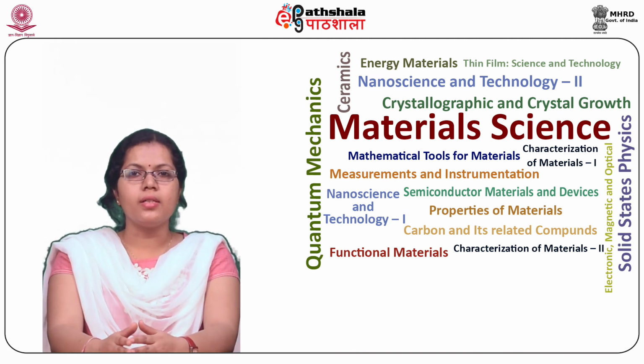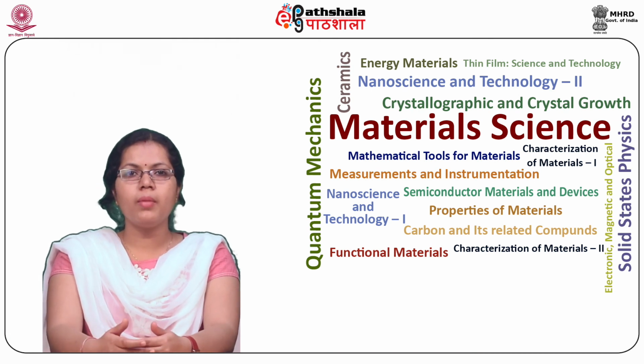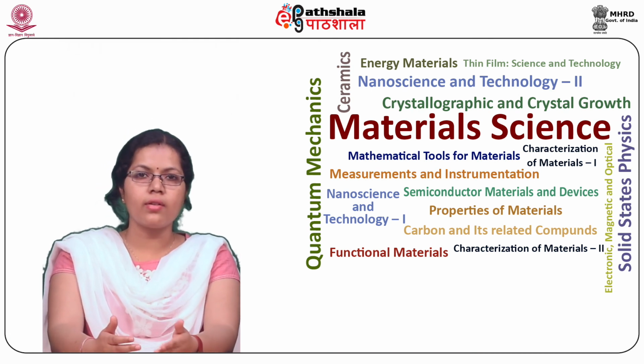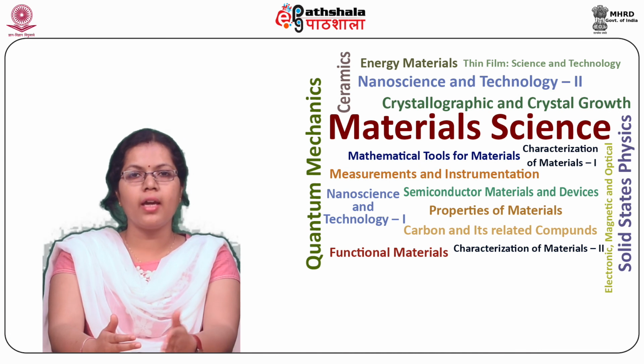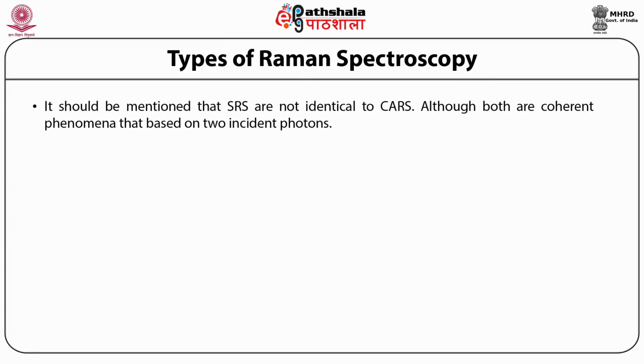Consequently, this will result in Stokes field amplification, where the intensity of the Stokes experiences a gain, and pump field attenuation, where the pump intensity experiences a loss, termed stimulated Raman gain and stimulated Raman loss respectively. It should be mentioned that SRS is not identical to CARS, although both are coherent phenomena that are based on two incident photons.